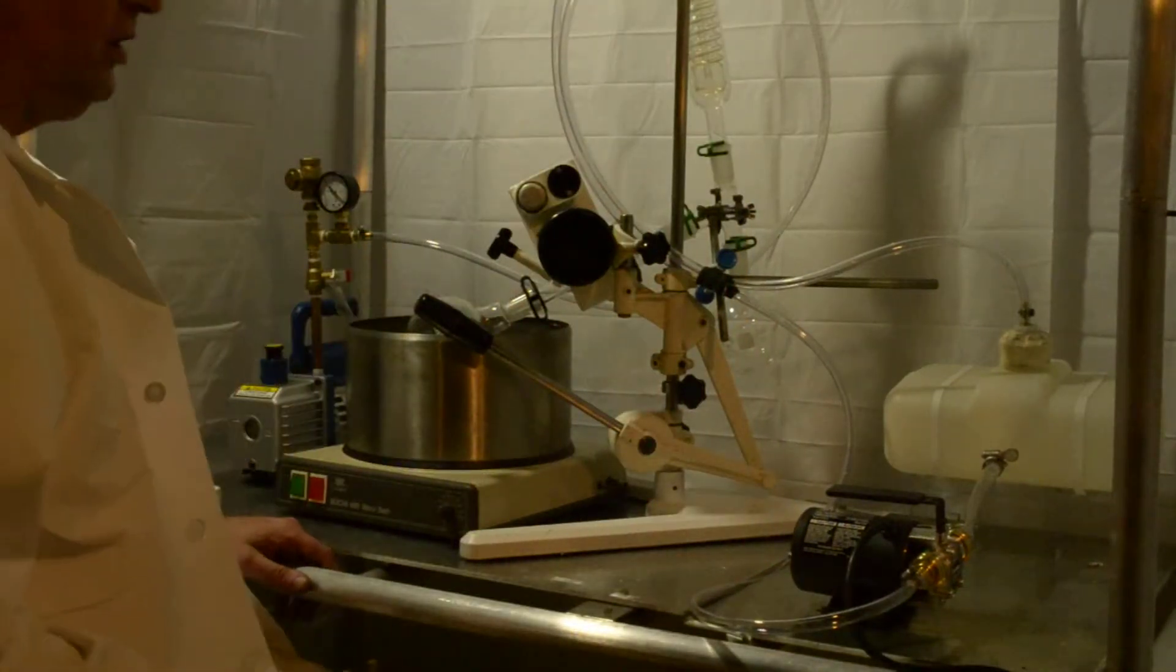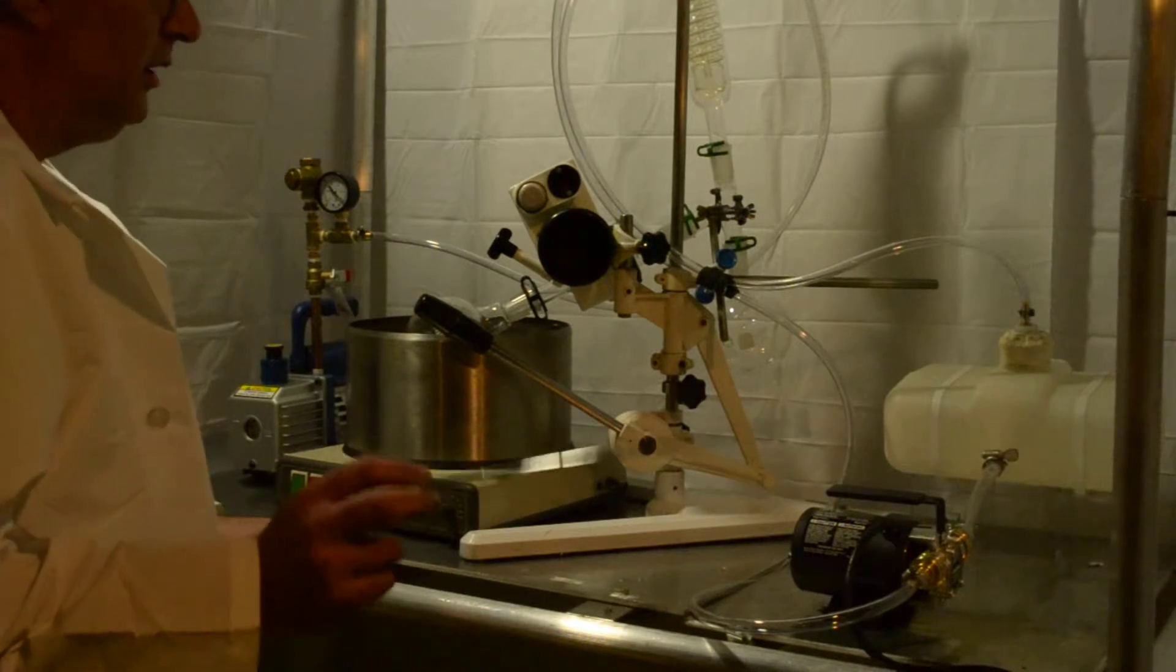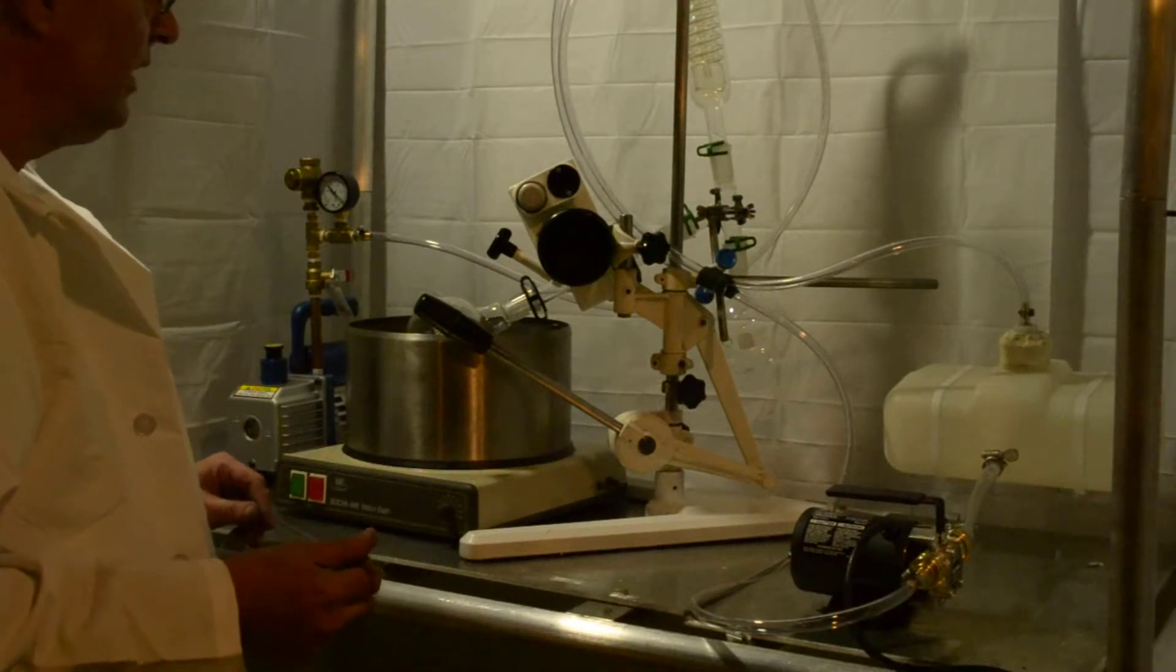Okay, this is the Bucci R unit and it's a complete cooling vacuum system.